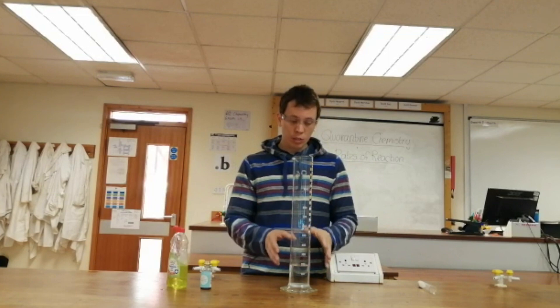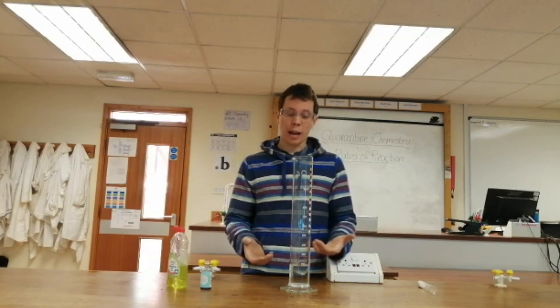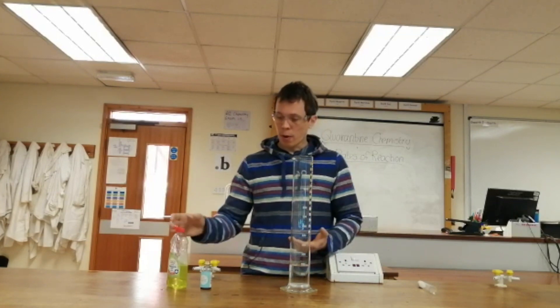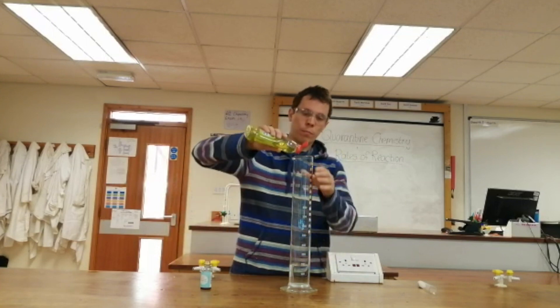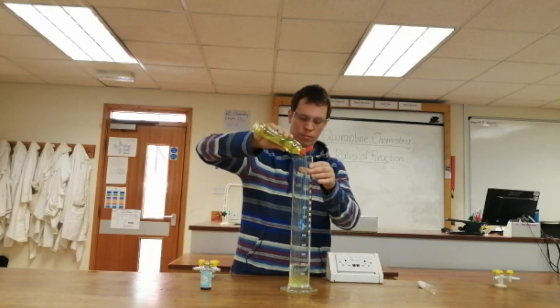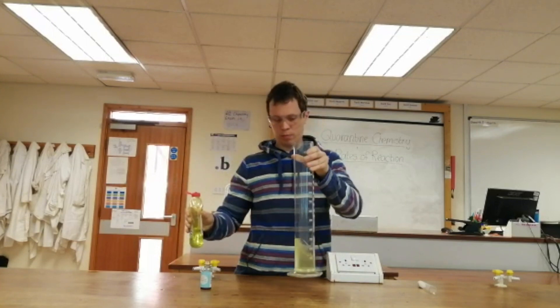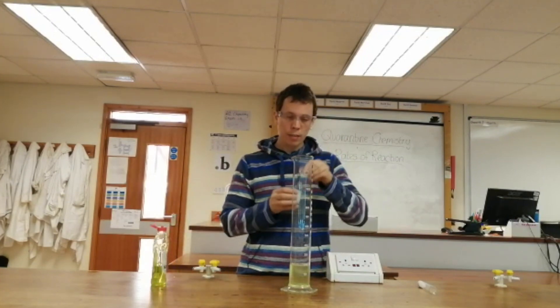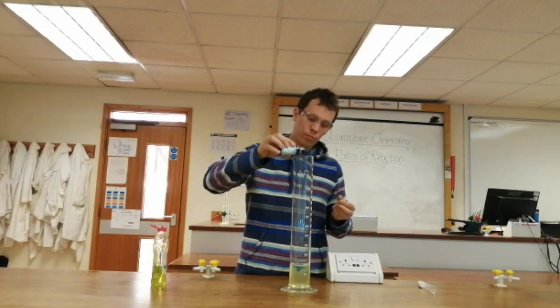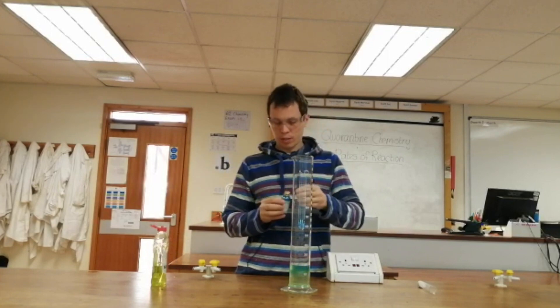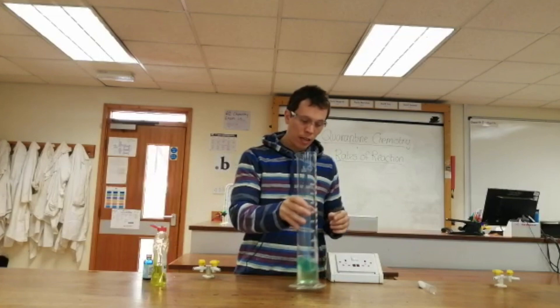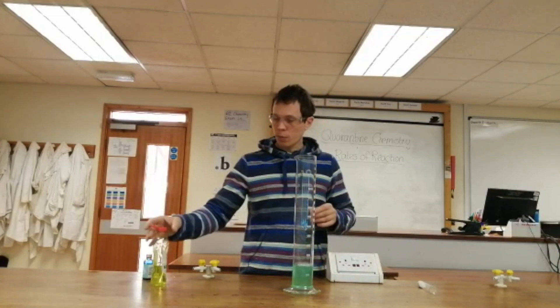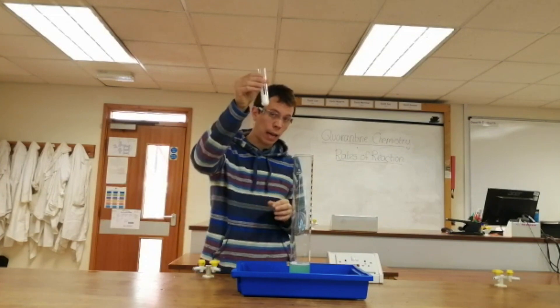Now so that we can see the impact that this catalyst has, I'm going to add a little bit of washing up liquid. And I'm going to add a little bit of food colouring as well, just so that we can see it clearly. And because this tends to be a little bit of a messy one, I'm going to pop the whole lot in a tray.